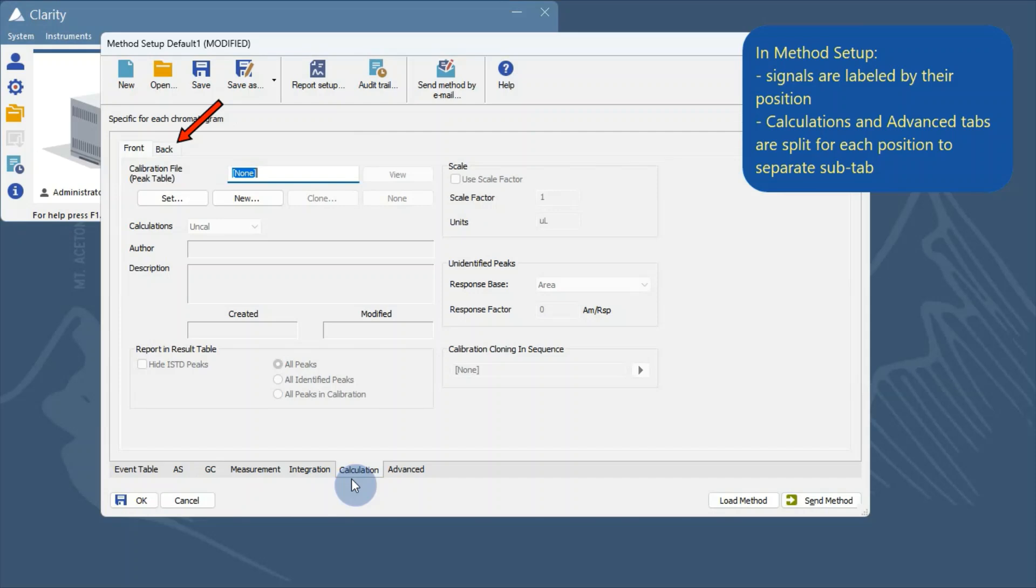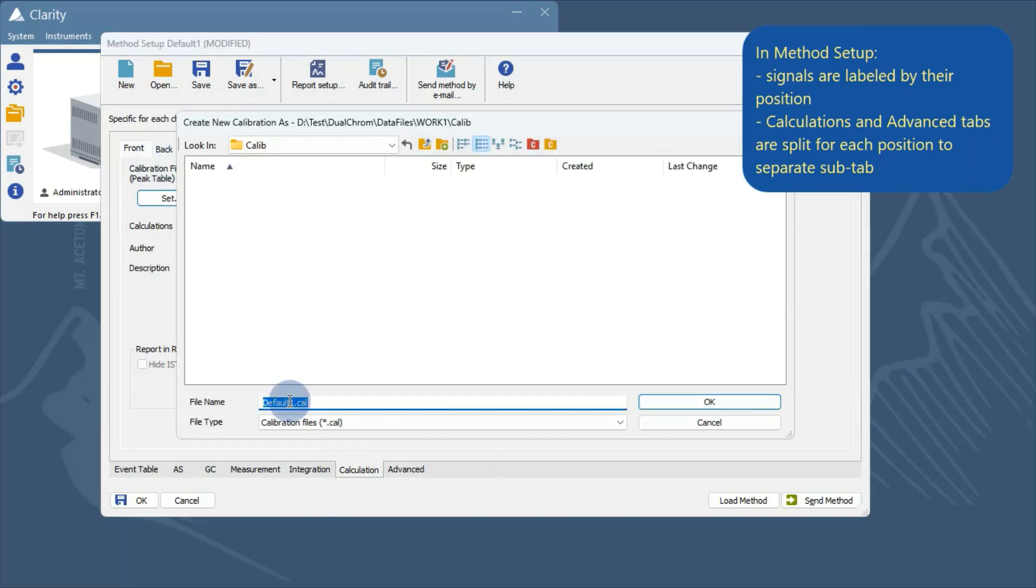In the method setup, the calculation and advanced settings are divided into separate tabs for each position. If a calibration file is set in the method, a different one must be assigned to each tab.